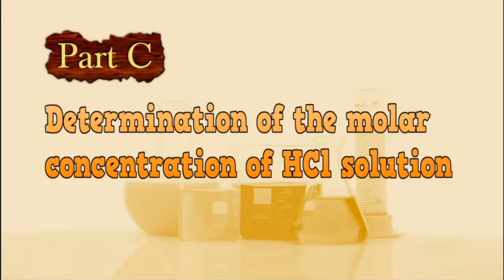In the burette, it is still the same sodium hydroxide solution, but for part C we just change the solution in the conical flask, to hydrochloric acid solution.